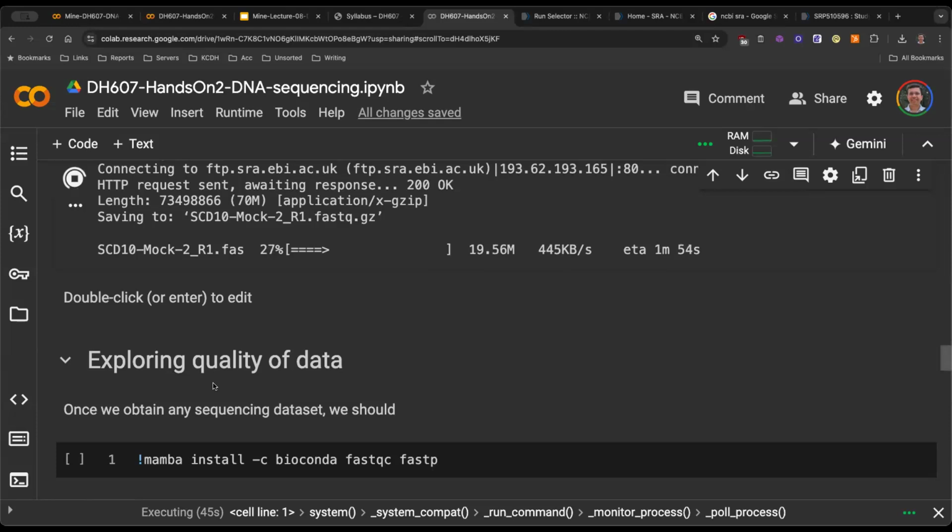And now you want to sequence these. So I take one of these fragments. I attach adapters to it. So this is your adapter 1. This is your adapter 2. Next step that would happen is, since you have these adapters, you can start to amplify the sequence. This is what happens on the flow cell of the DNA sequencer.